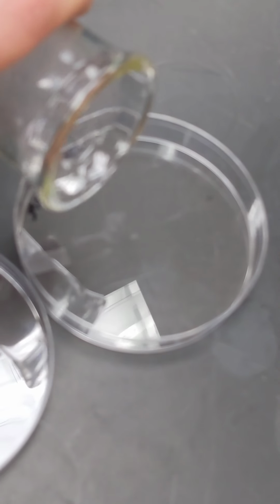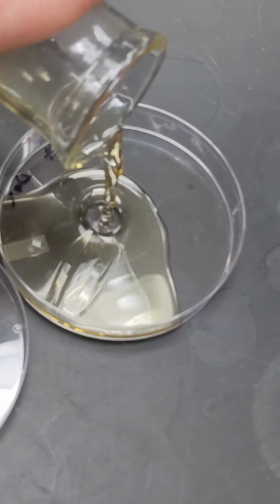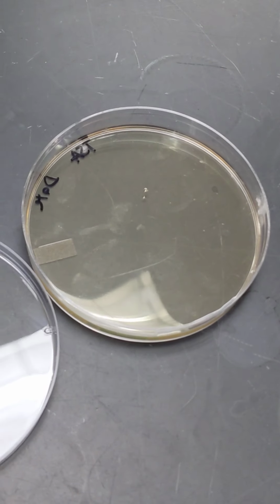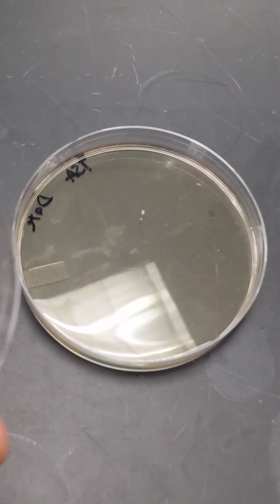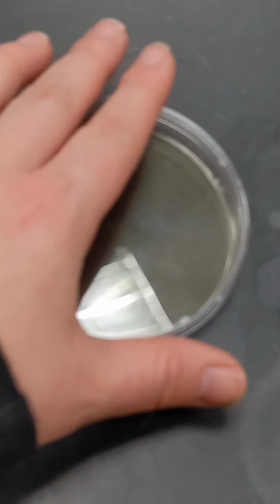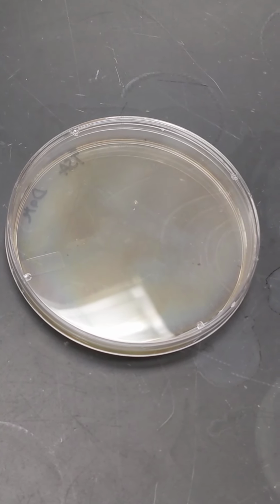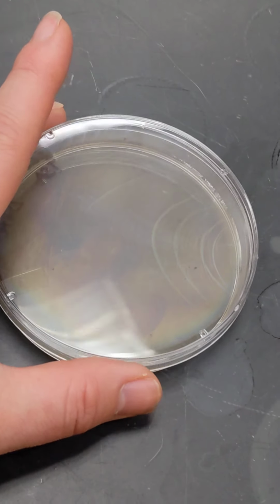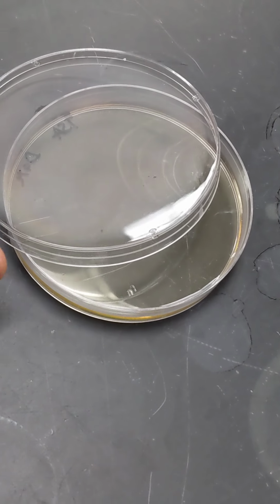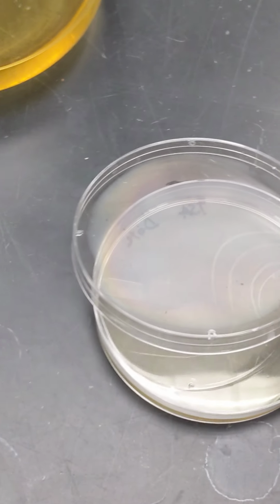Also in the hood, I would open up my plate. I would pour a certain amount of that beautiful liquid, just enough to cover the plate. If it's a little under, I can give it a swirl and it will cover itself. And then I'm going to cap that. Now, if my media is still a little on the warm side, you're going to notice that a swirl of condensation is going to form. So usually in the hood, I'll go ahead and vent these plates so they breathe a little bit better and they don't get a bunch of condensation.